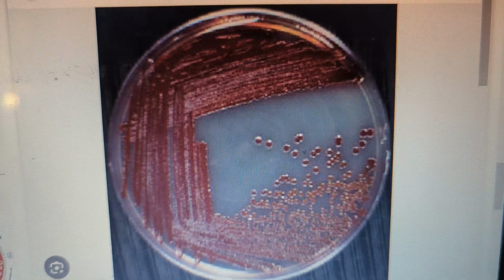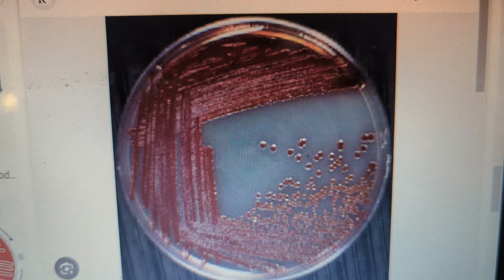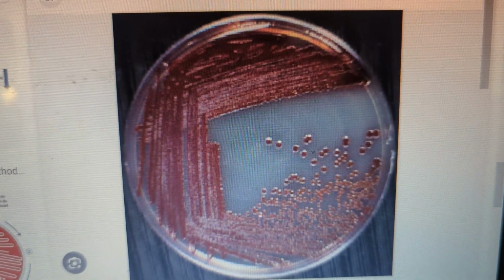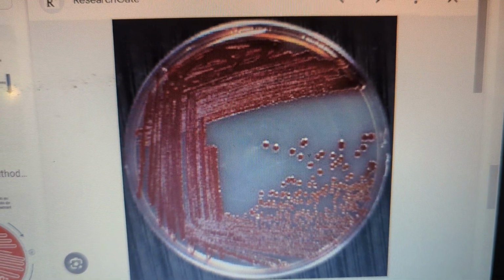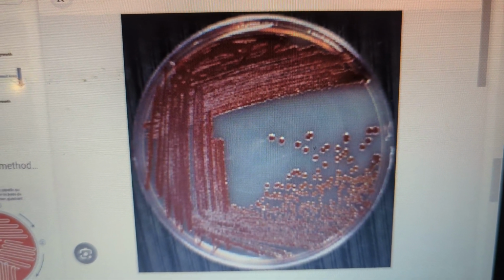Okay. So basically that is it about aseptic techniques, and then of course aseptic inoculation. Okay, that would be the end of our aseptic technique lab introduction.